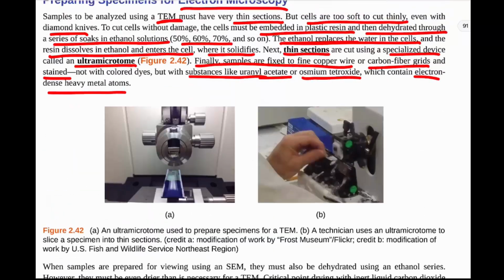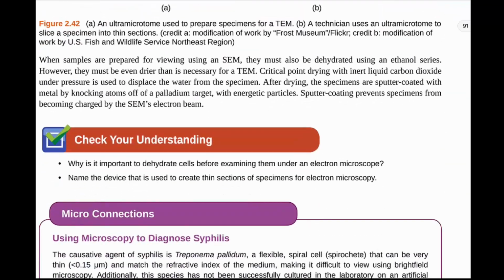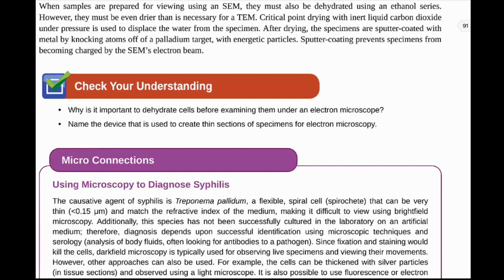And then when they cut it into thin sections after that, they fix it to this copper wire or carbon fiber grid and then stain it with heavy metals. When samples are prepared for SEM, then they must also be dehydrated using the ethanol series. However, they must be even drier than the TEM.